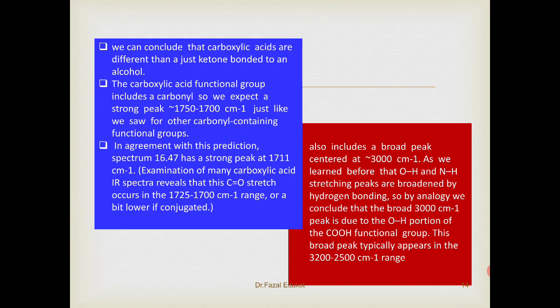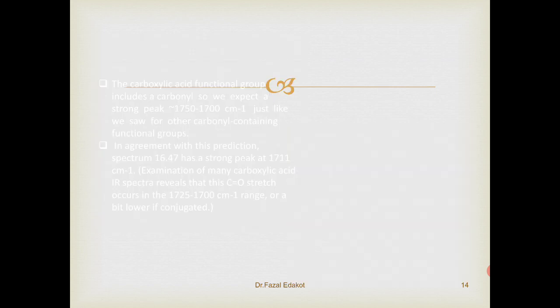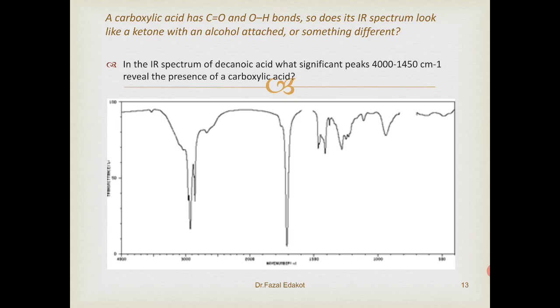So we'll stop over here. Next we will switch over to amides. So please revisit the spectra and compare with the points. You need to note down those points and cross check with the spectra. And of these values, I have cited only the important ones. So you need to learn these values by heart. There is no other way.